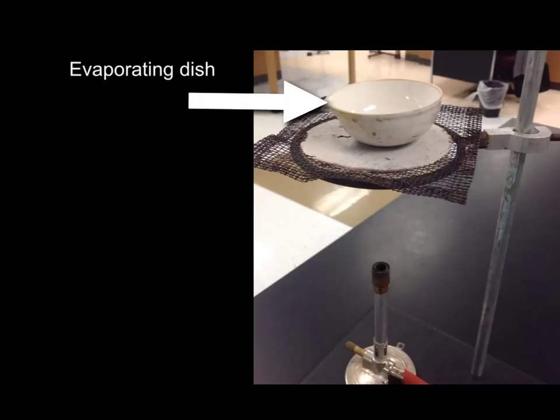One other thing that you could use over a Bunsen burner is an evaporating dish. And just like its name suggests, it's used to evaporate the water out of a solution so that you leave the solid that's dissolved in it behind. And its shape is very specific for that purpose. So you could suspend it over a Bunsen burner just like you would a beaker.